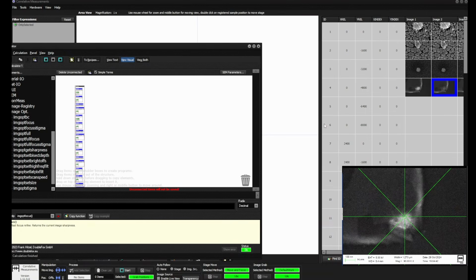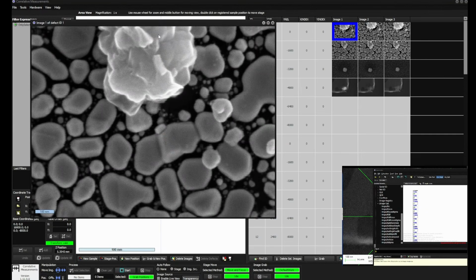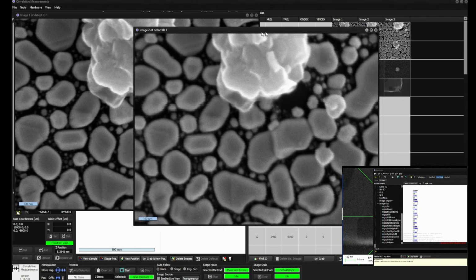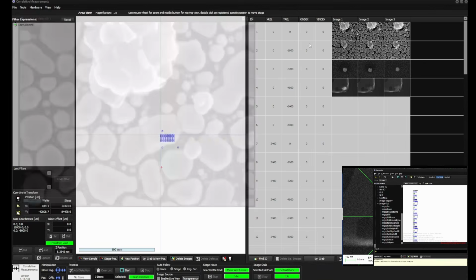Finish. Now let's compare. The first images are always at the beginning here. I will move this away. So this is the last image, then we have this one, which is only with focus. You can see that the edge here is on that image even a little bit better. So it has improved something here.